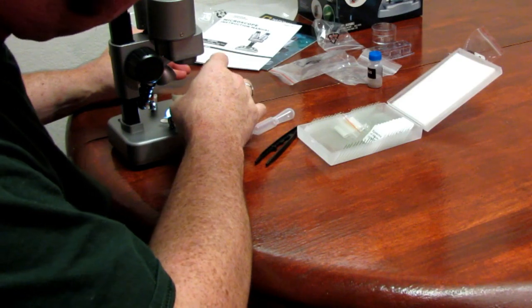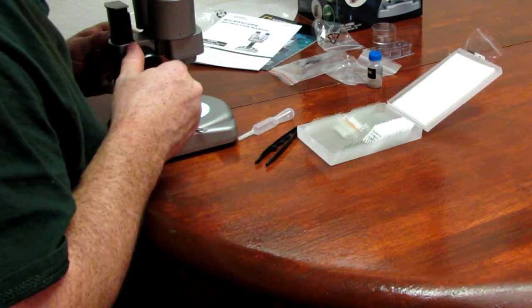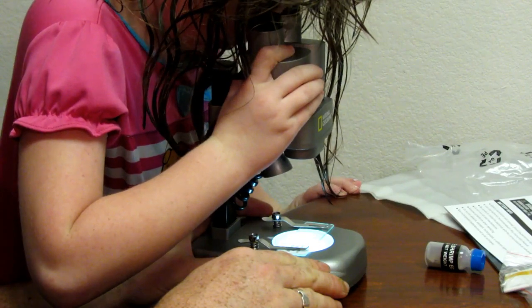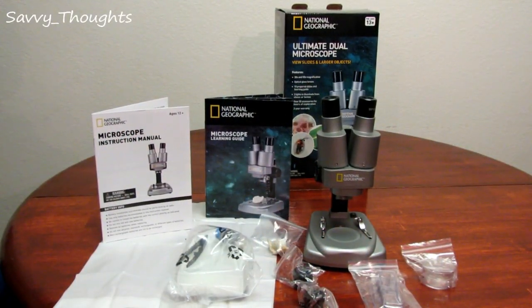Overall, I think that this is a very nice set, especially with the lenses being so clear. I hope that this gives you a better idea of their product. Thank you very much for watching, and have a good day.